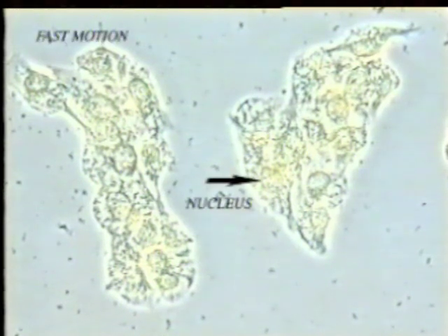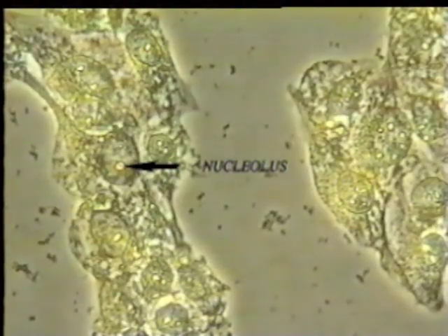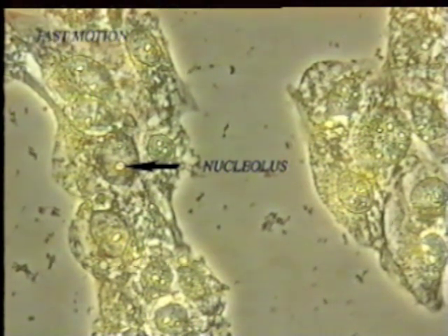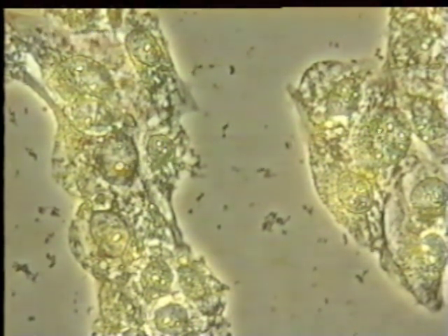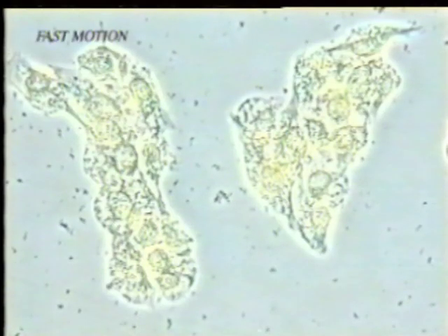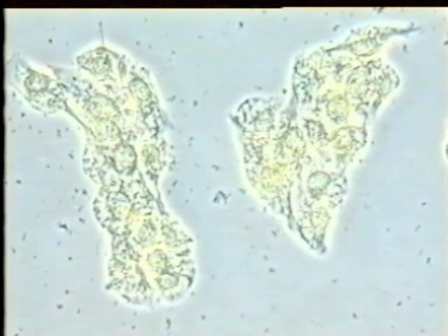After 30 minutes' contact with the anti-cancer agent, nuclei of some cells are already yellowish in places and nucleoli are stained pale gold, showing where PB100 concentrates. Cytoplasm is very slightly stained, but its organelles remain colorless.